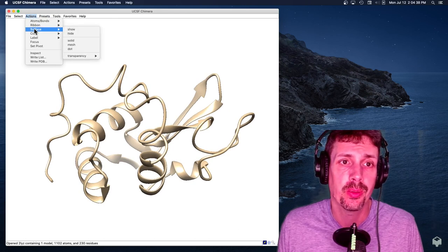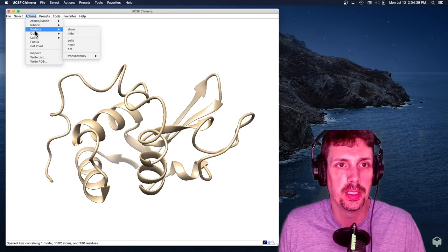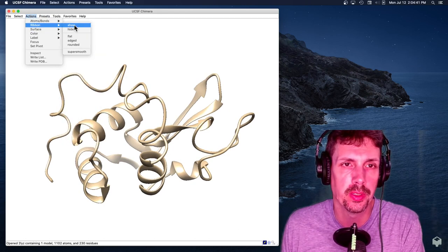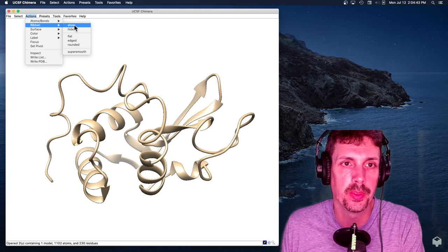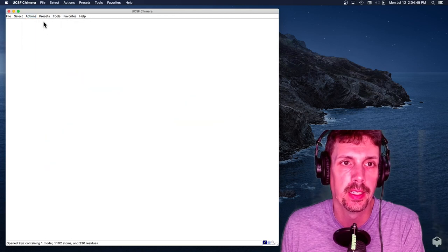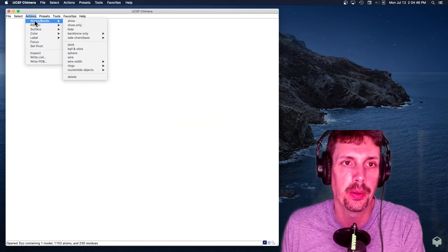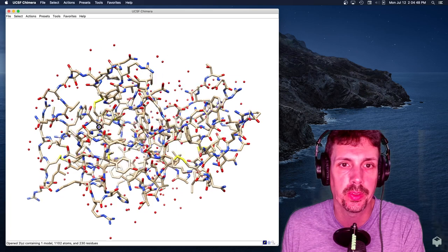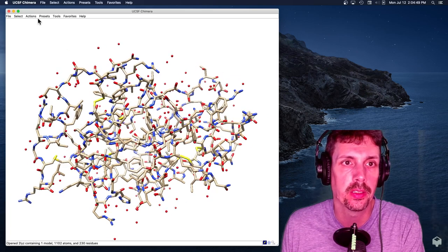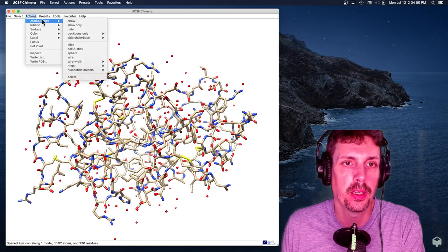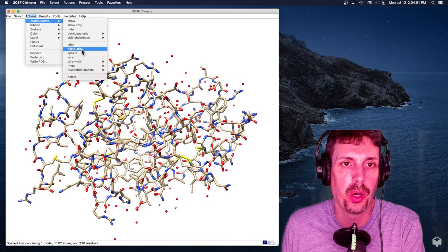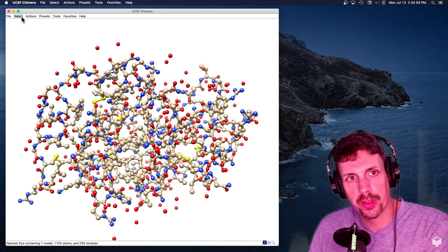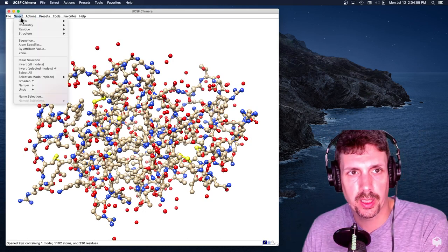All right, I'm not really interested in the ribbon today, so I'm going to hide that. And I'm going to show the atoms right here. I guess I'm kind of in a ball-and-stick mood here. All right, but I want to get rid of the solvent atoms.